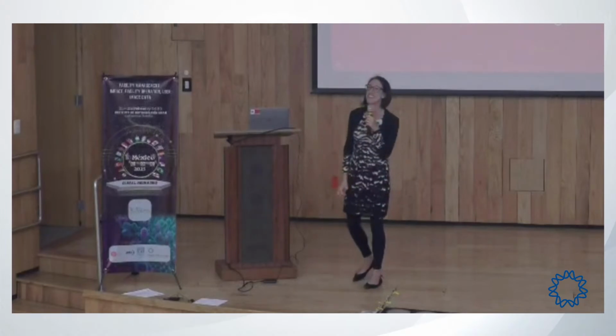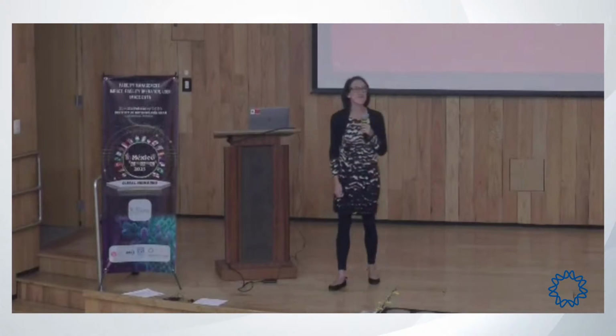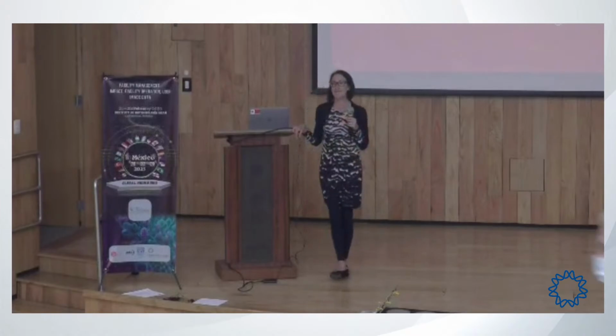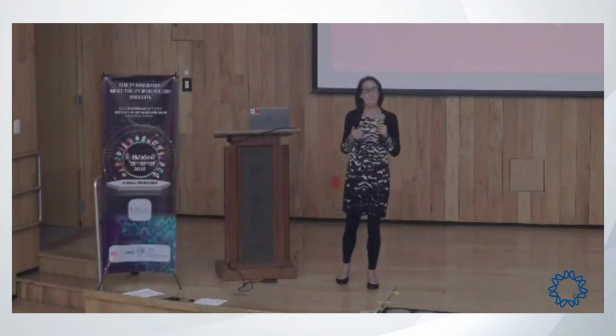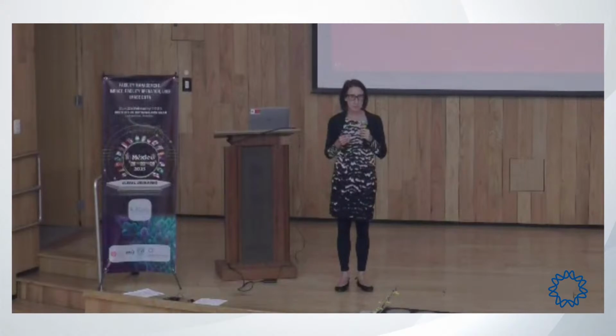Okay, just one last question. How can you discriminate your protein of interest when you're looking for some small protein inside the cell? How can you identify it and discriminate it from others? I think this is a question more or less related to Philip's and Rocco's. Can you bind some antibody with some metal?